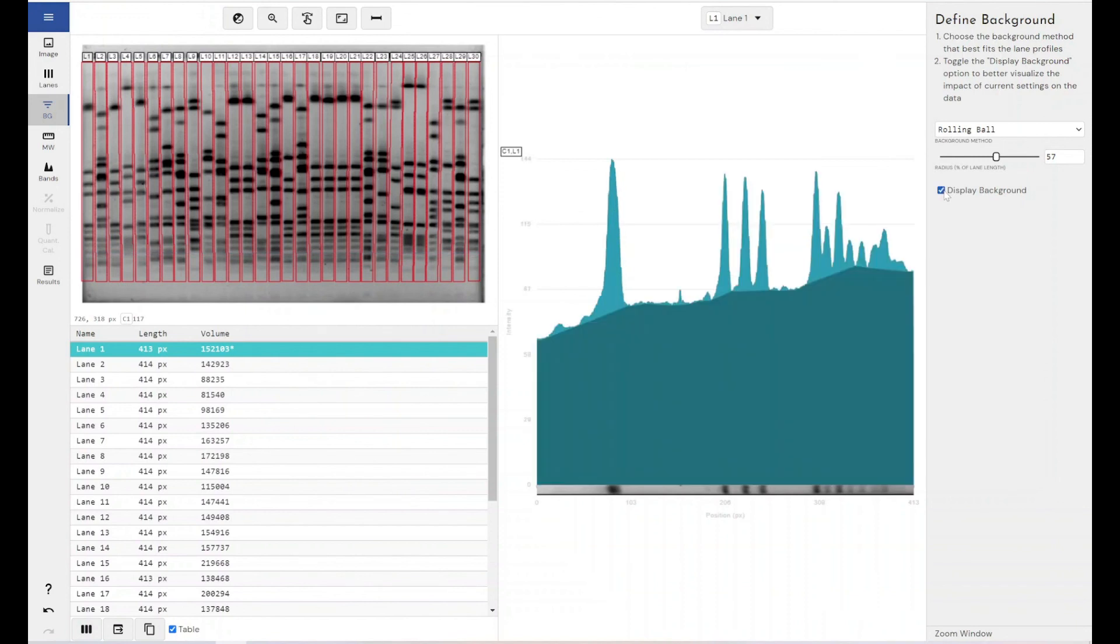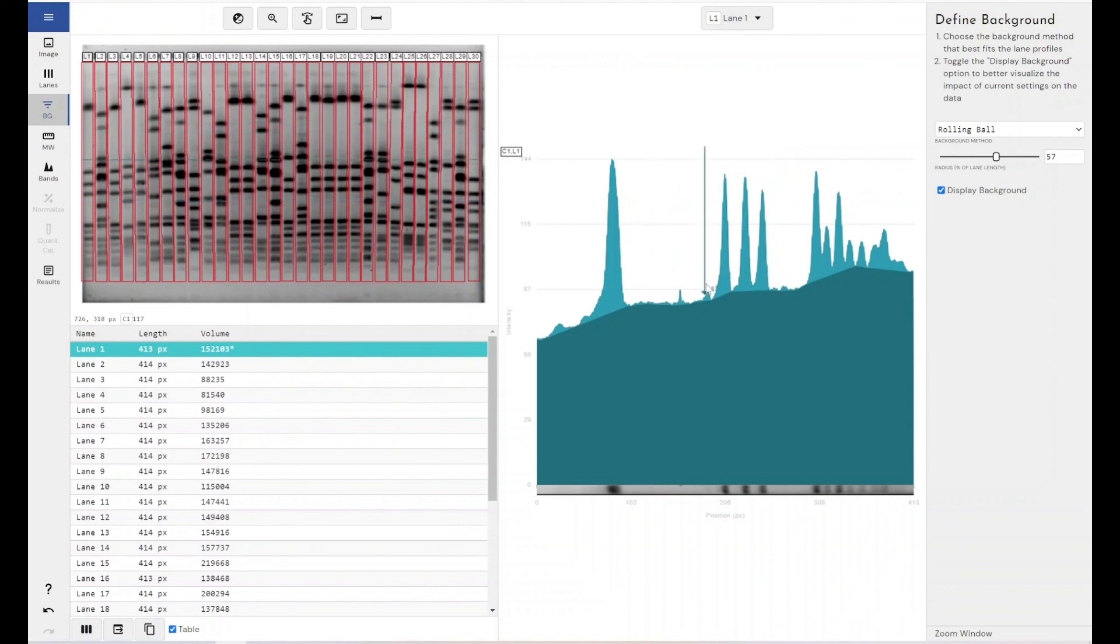So you do have a lot of visibility about how your data is going to look with each of your background removal techniques. But what you're looking for is to remove all the areas of no signal here so you can just focus on the areas where you definitely do have signal within your experiment.